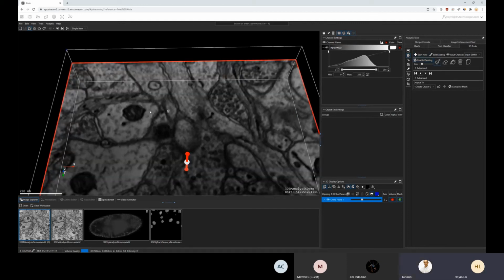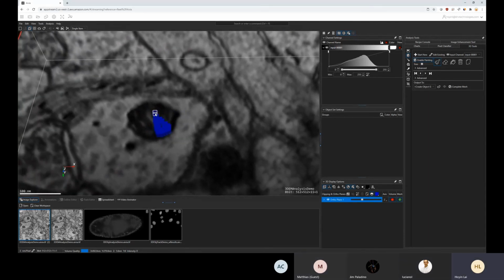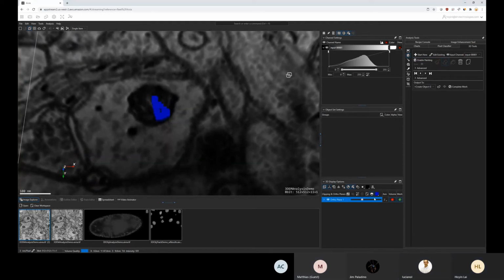You can create a new slice by clicking on Start New, and when you do that, you can mouse over the image somewhere. This is a little bit small, so let me zoom in. I probably need to change my orientation a little bit. Oh wait, I'm going to turn off the enable painting. Okay.